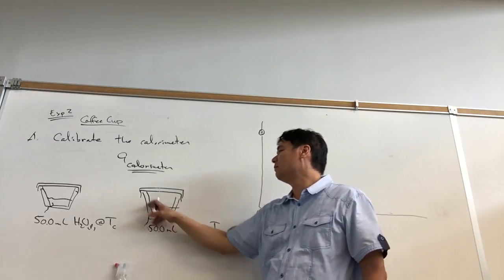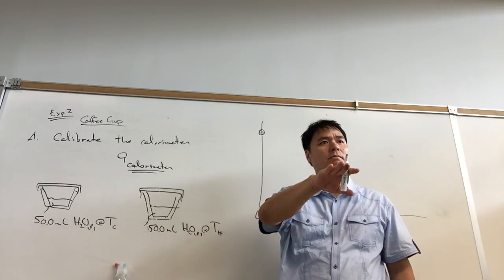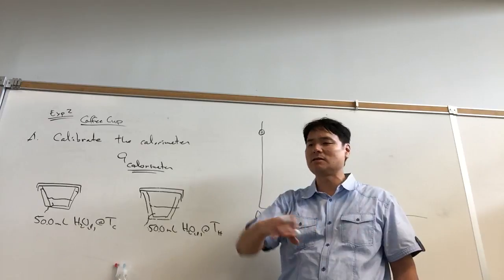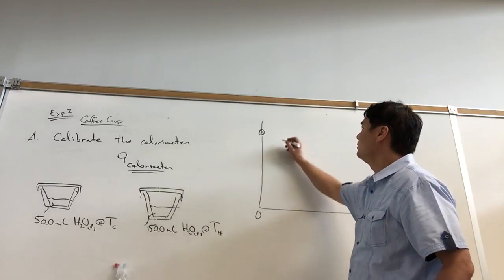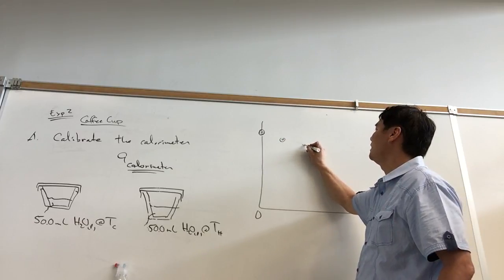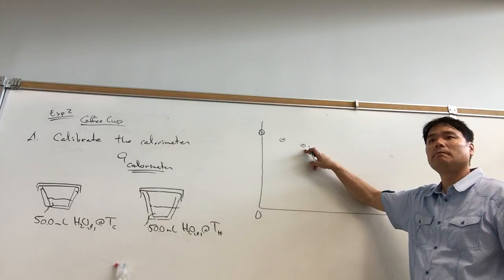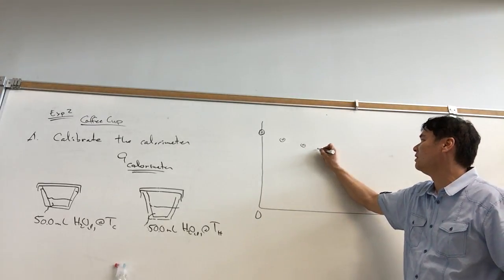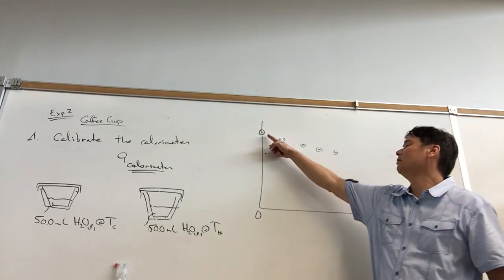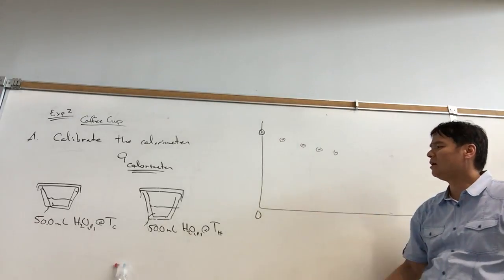Now, if it's in the cup, then it should just cool nice and slowly, right? Versus if we're manipulating the water, it's going to cool rapidly when it hits the grad cylinder and everything else. So we're just going to take temperature readings every minute to see how it cools in the styrofoam cup. It should have a pretty secure lid. We're going to collect 5 minutes worth of data here, and we see it cools in a nice, what is that, linear or non-linear?